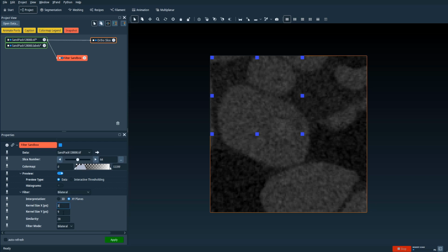So let's just change the parameters, for example. Okay, so you can just keep trying different parameters. So this might look sufficient for you. Again, it depends on your data set and use case scenario.